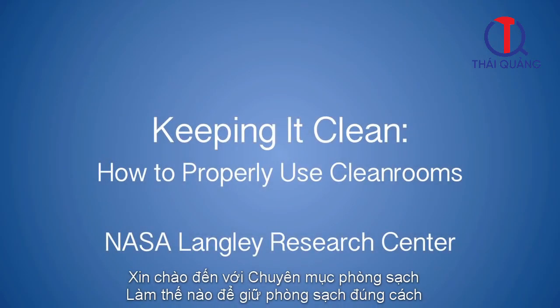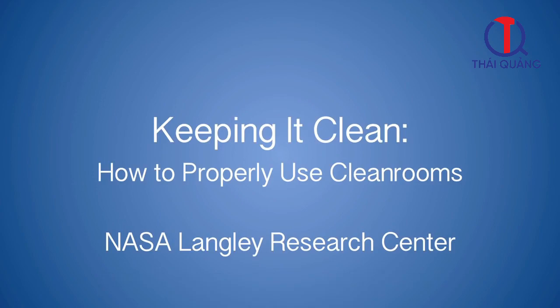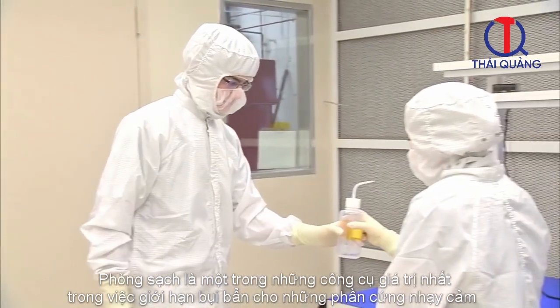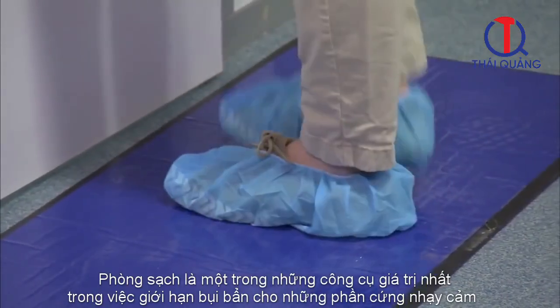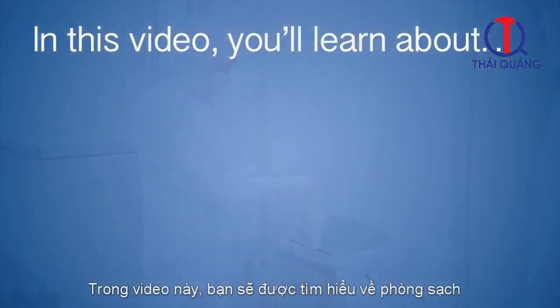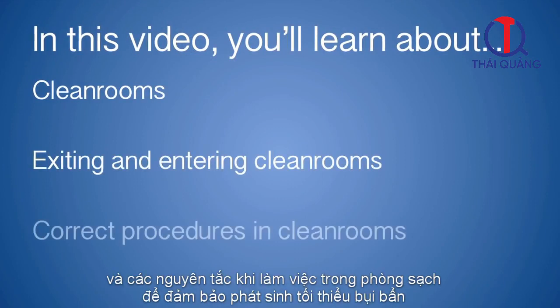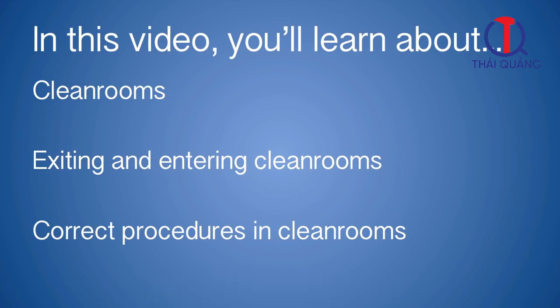Welcome to Keeping It Clean, How to Properly Use Clean Rooms, provided by NASA Langley Research Center. Clean rooms are one of the most valuable tools in limiting contamination of sensitive hardware, such as optics, science instruments, and spacecraft. In this video, you'll learn about clean rooms, how to enter and exit a clean room properly, and correct procedures for operating in a clean room to ensure minimal contamination.